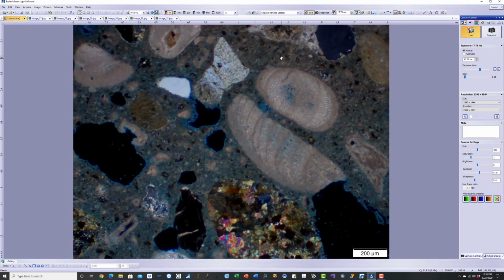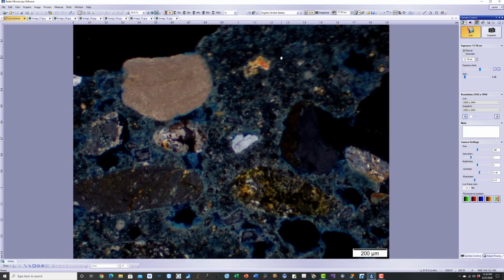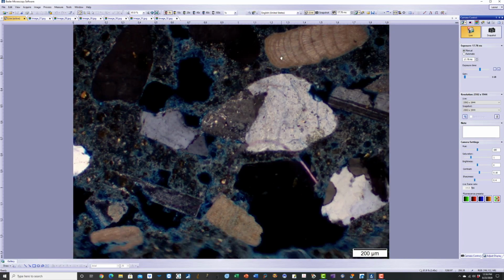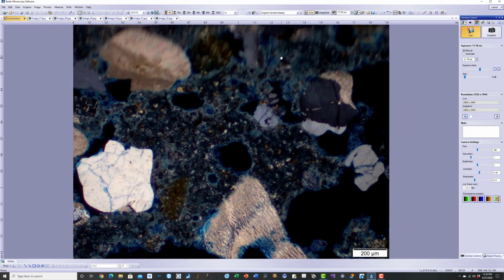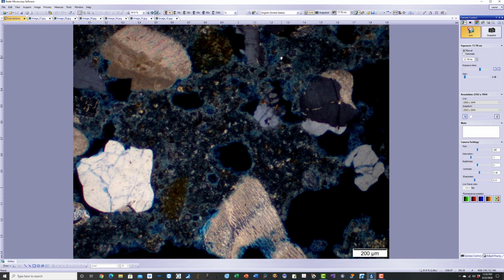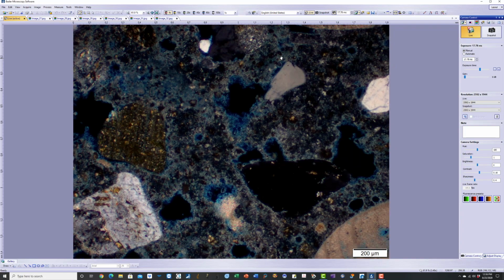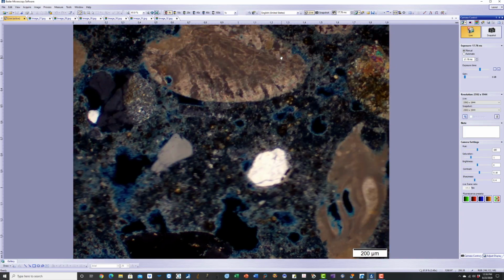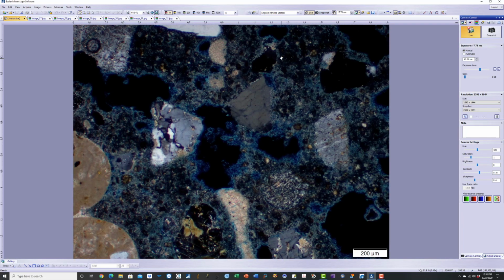So minimizing the carbonation of this mortar coating would be the goal for it to be effective in preventing the concrete from penetration of corrosive agents. The fact that this mortar coating is carbonated so much in the interior indicates the coating could have been densified with a better degree of cement hydration.